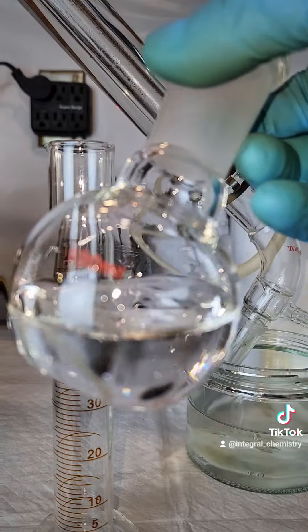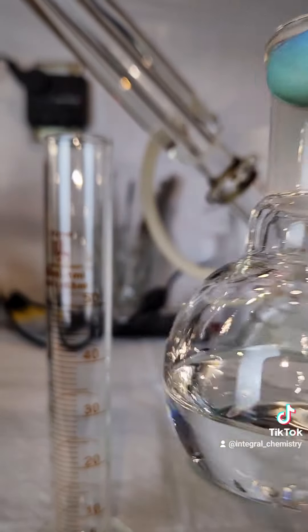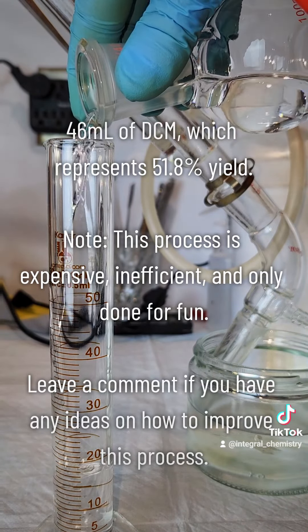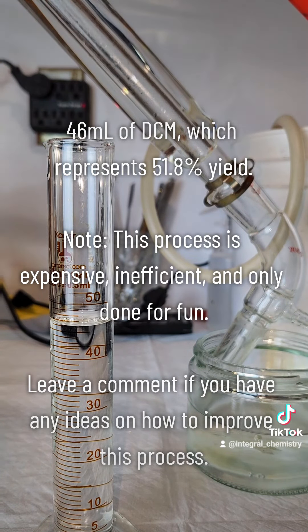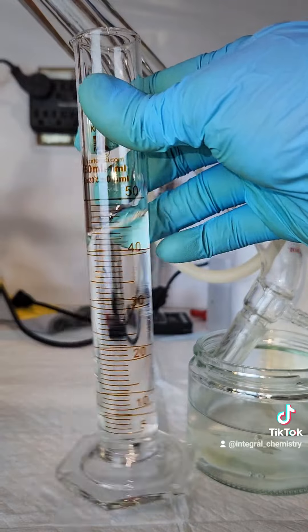As I said earlier in the video, this is not an efficient process. I only got about a 52% yield, and considering how long this took and the cost of the reagents I used, this is pretty miserable. That said, I had a lot of fun with it, and I hope you guys enjoyed watching it. If you liked this and want to see more like it, give me a follow.